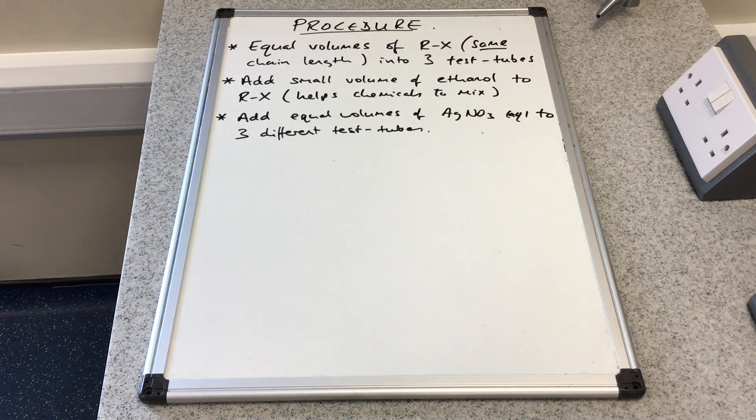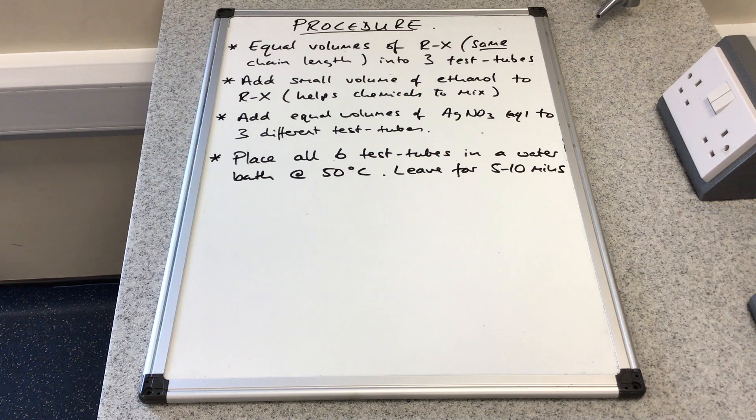You'd then get three more test tubes and add equal volumes of silver nitrate solution to those. Then place all six test tubes in a water bath at around 50 degrees C and leave them there for five to ten minutes to ensure everything's at the same temperature.